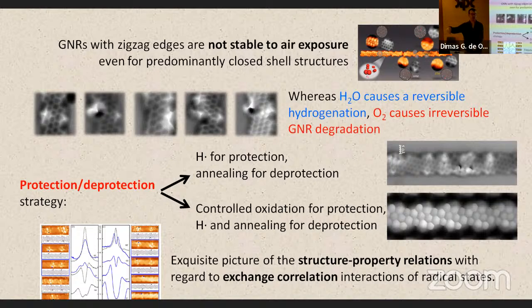Okay, you contact the ribbon? No, this is actually a tunneling experiment. We have the gold substrate, we have the ribbon on top with our unpaired electron with our spin, and then we go with our scanning tunneling microscope tip. So basically, we have a two-electrode circuit in which one of the contacts is our microscope tip, and the other contact is our substrate, and that's the current flow. And that's where we see this Kondo resonance.